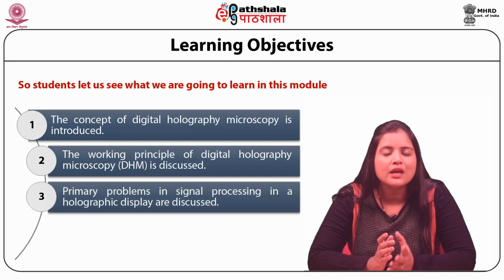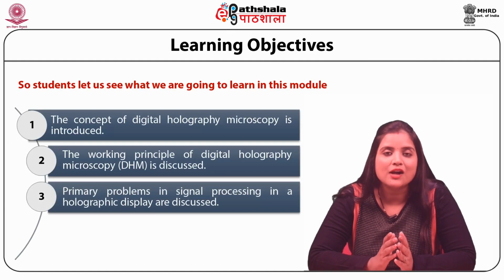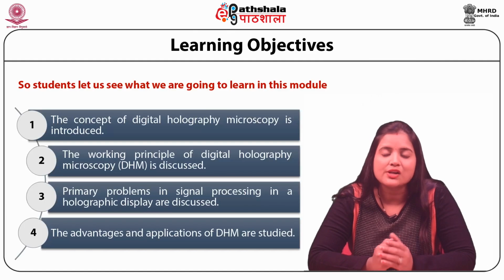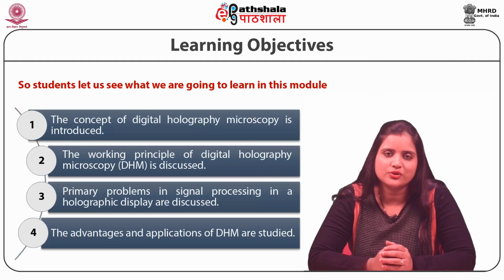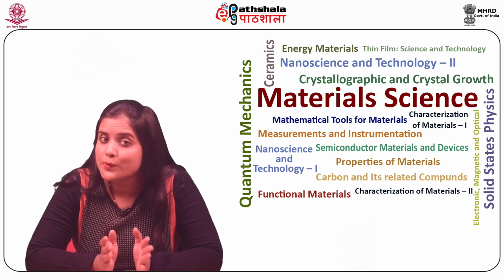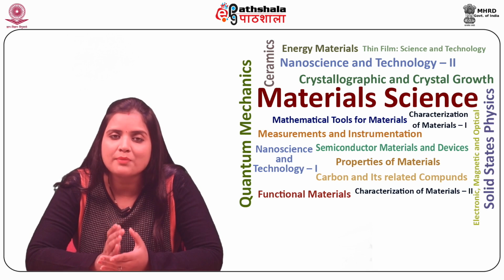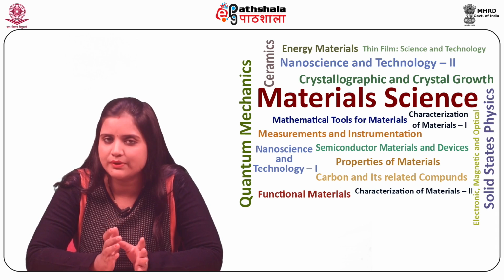Primary problems in signal processing in a holographic display are discussed. Finally, the advantages and applications of DHM are studied in this module. The field of holography is most certainly mature. It is now over 60 years since Dennis Gabor's Nobel Prize winning invention of a new microscopic principle.